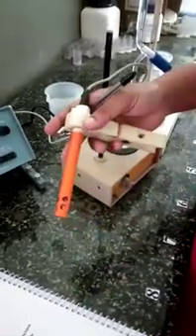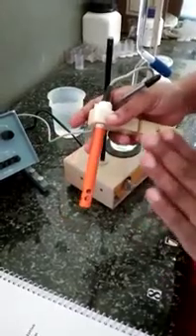Particularly, we are measuring the specific conductance, using a conductivity cell which contains two platinum electrodes having a cross-sectional area of 1 square centimeter, and the distance between the two platinum foils is 1 centimeter. Whatever conductance you measure using this type of conductivity cell is called specific conductance. So we are measuring specific conductance here using the conductometer.